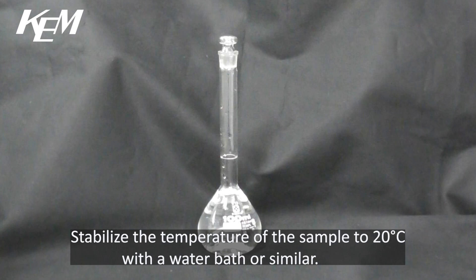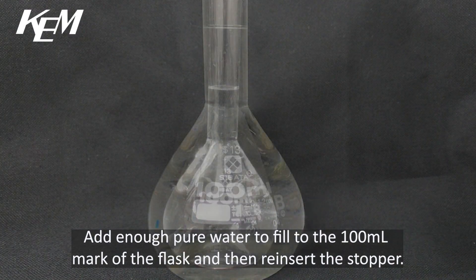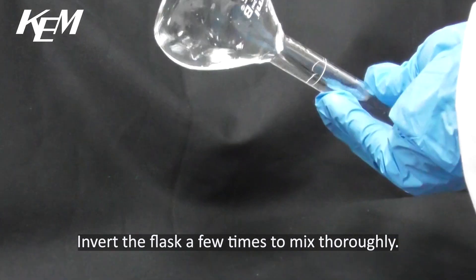Stabilise the temperature of the sample to 20 degrees Celsius with a water bath or similar. Add enough pure water to fill to the 100ml mark of the flask and then reinsert the stopper. Invert the flask a few times to mix thoroughly.